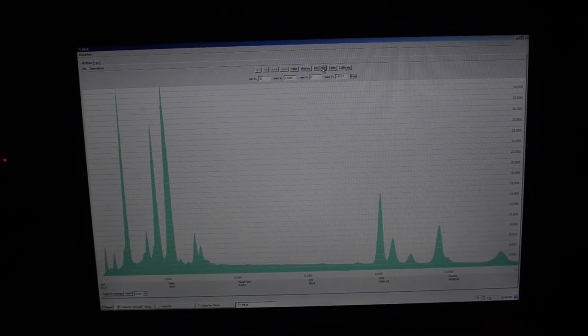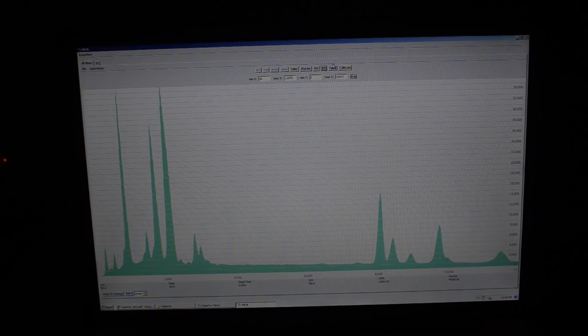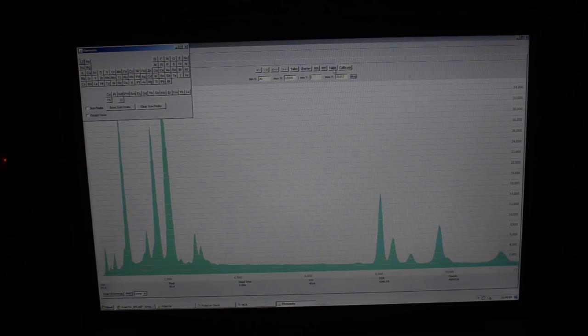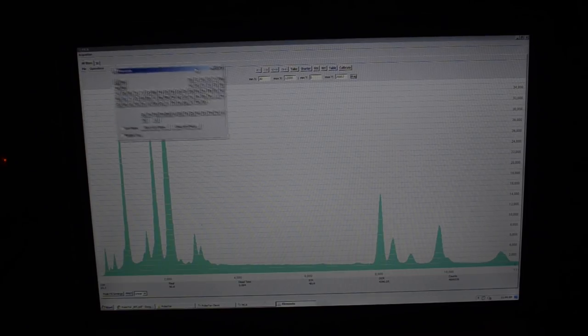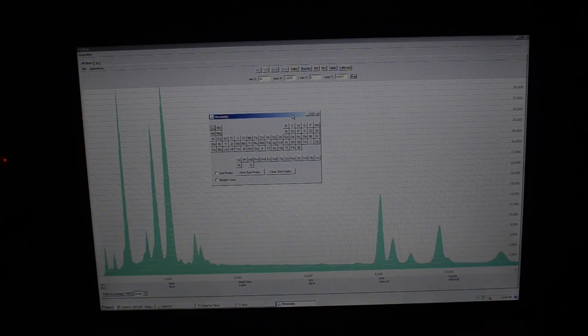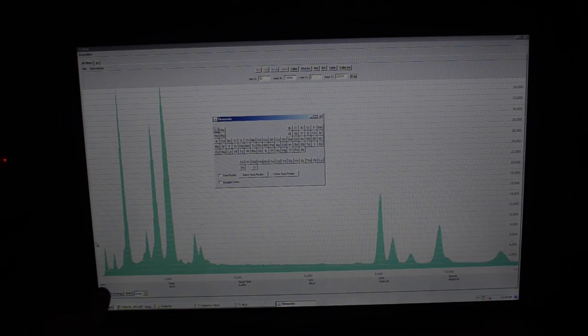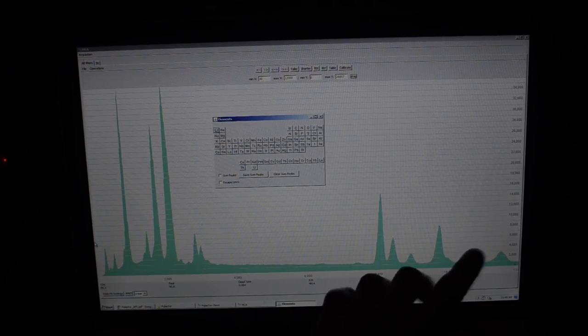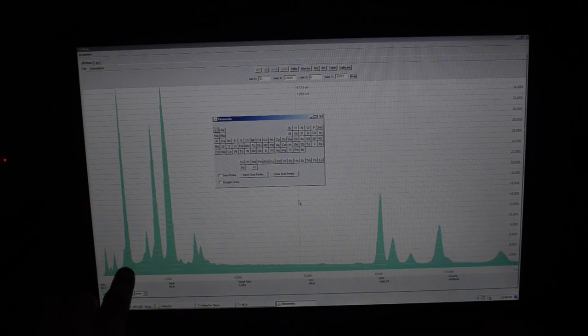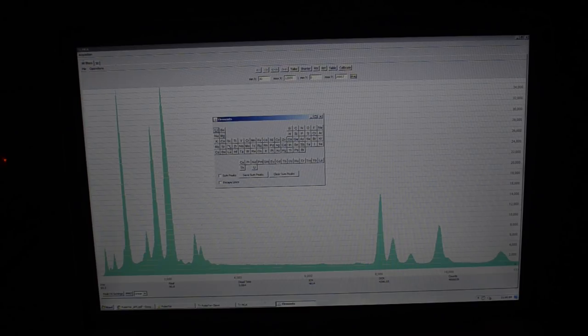So here's our data. It's pretty cool. There's some advanced software that will automatically label things for you, but X-ray analysis is very much so an art. I'm quite an amateur at it. But we can open up the table here and we can start guessing at what some things are. These were metal wires. I would assume it could be things like copper, golds, and stuff like that. This is the low-energy end of the spectrum. This is the higher energy end of the spectrum. Things like carbon, nitrogen, oxygen are down here, and then heavier metals and stuff will be on the right.